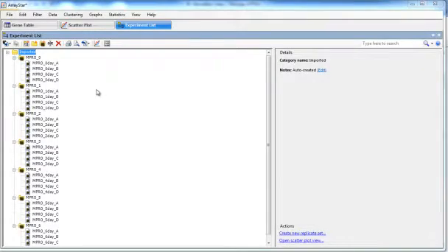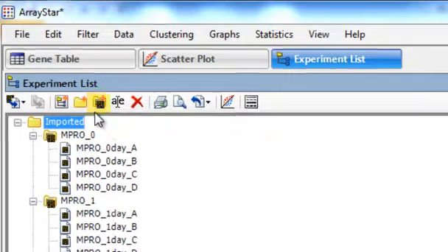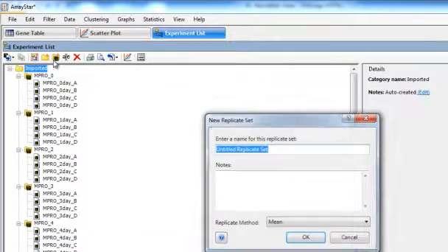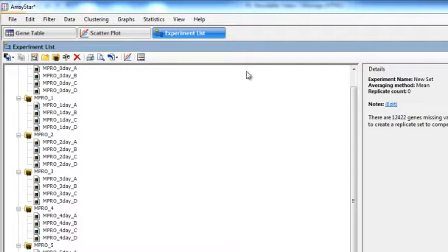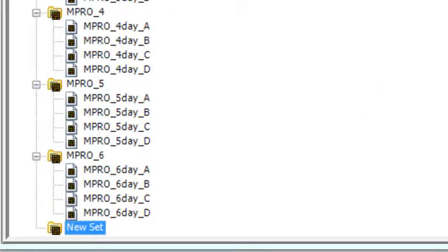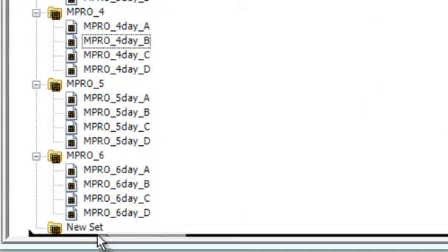From the Experiment List view, you can also create replicate sets by clicking on the Regroup Replicates by Name or Attribute tool, or by manually placing your data into replicate sets through the Create New Replicate Set tool. After naming your set, you can then drag and drop data into your set to complete it.